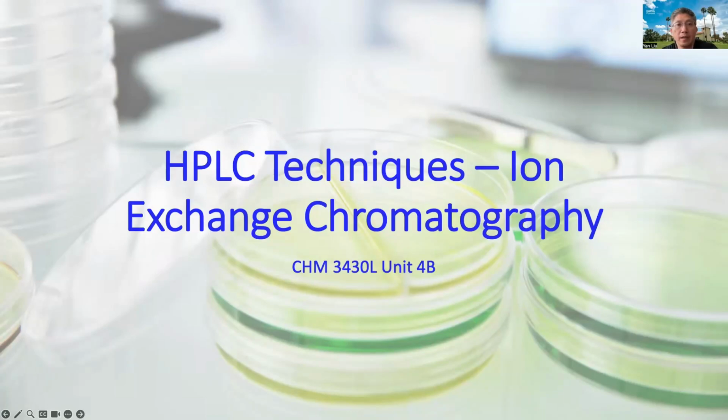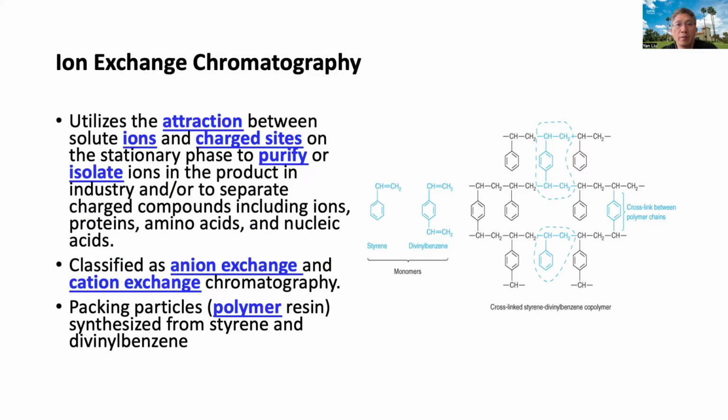Hello everyone. Section 4b uses another type of liquid chromatography, ion exchange chromatography. Ion exchange chromatography is based on the retention of ions by the charged stationary phase. Depending on the nature of charge, it is classified as anion exchange and cation exchange chromatography.